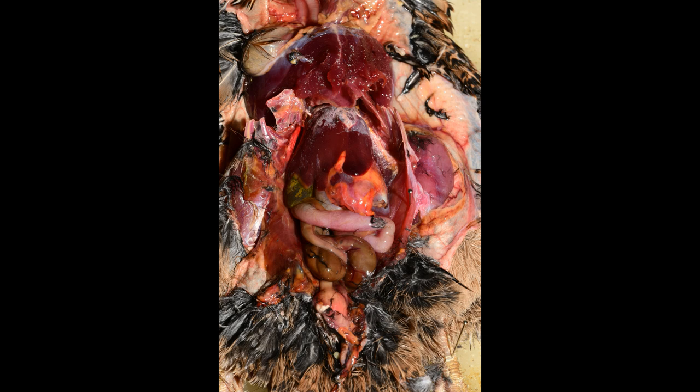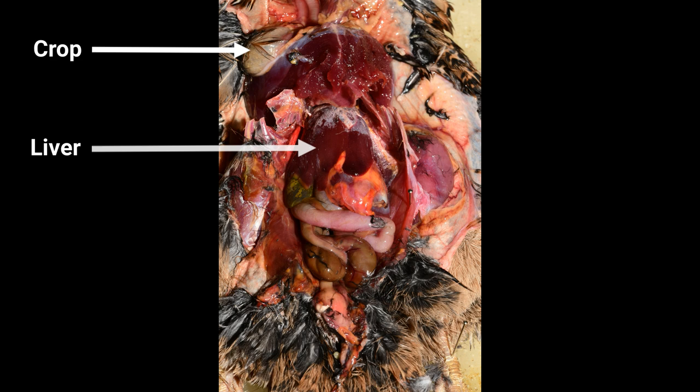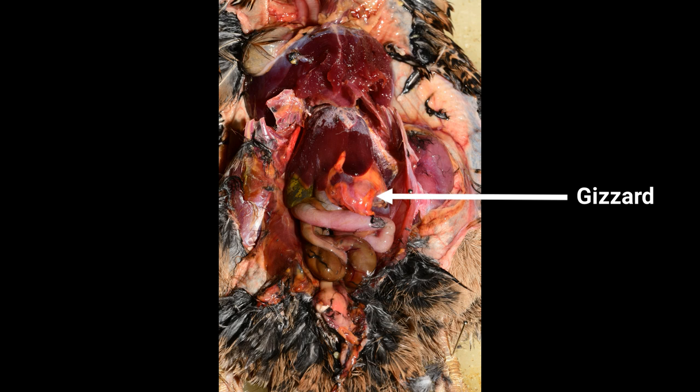The prepared abdominal cavity now reveals the crop, liver, large and small intestines, as well as the gizzard, and the small green gallbladder, the latter of which is lacking in some birds. The stomach is divided into the anterior glandular stomach and the posterior gizzard.